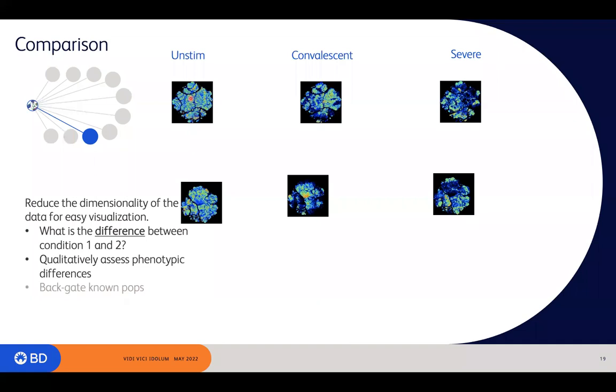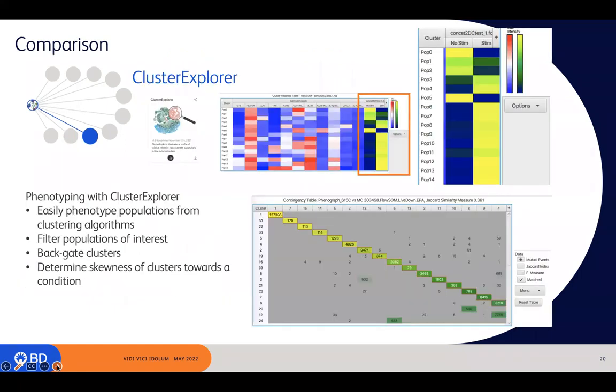But what I was attempting to show you here is that you could just set up a series of t-SNE plots comparing each condition across the other, and all you're going to see is that there is depletion in some locations and enhancement in others. And to me, this is not a very good slide because it's not prepped. But it is a means of making some sort of immediate inference as to what's going on in the data file.